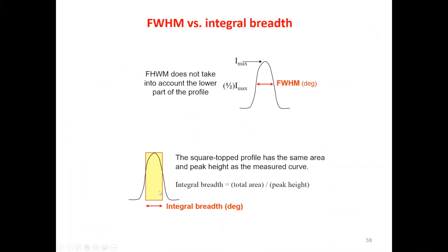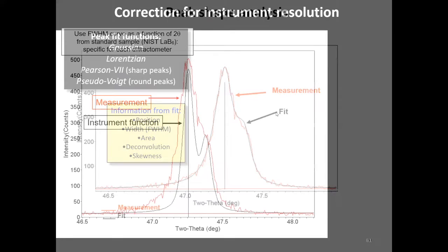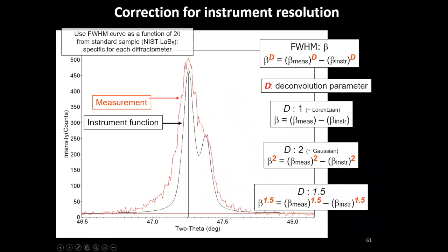One case that I like to show is this. Let's say a copper material where you have, for example, a peak at 40 degrees, 1, 2, 3, 4, 5, 6 samples, the same peak at different broadening. Take, for example, 3 researchers that will do the analysis for you, some of the best users we have. Basically, each one is going to do the correction in one particular mode.